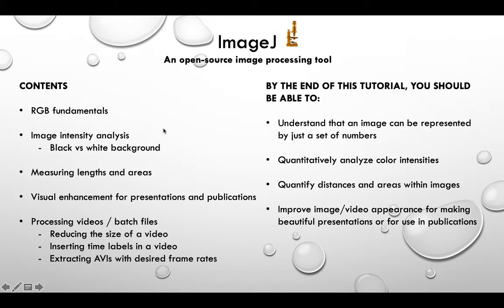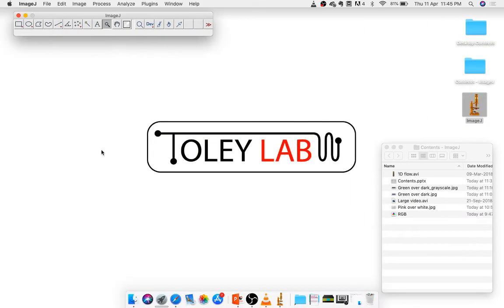And in our lab, there are typically two different kinds of images that we acquire for sensing. There are things that are often on a dark background on which you develop some color. This is typically fluorescence. Or they're typically things on a white background on which you develop not fluorescence but visually visible color. So we'll look at both of those cases and try to do some image analysis on them, or quantification. Let us start with pink over white.